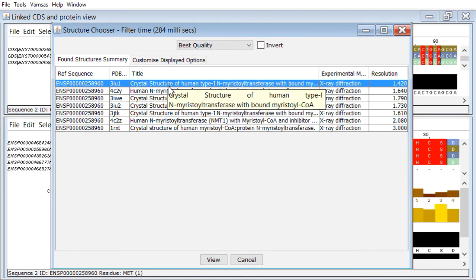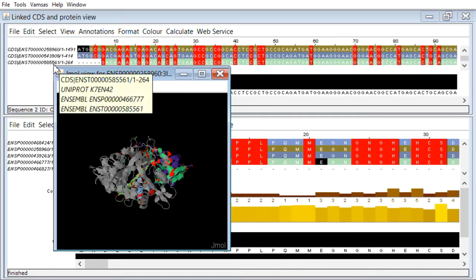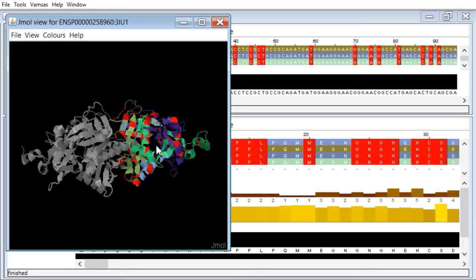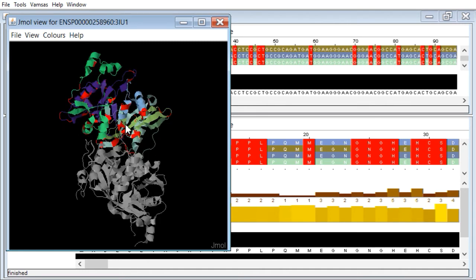And there we go. Crystal structure of human type 1 N-myristyl transferase. Let's go with that and view that. This comes back and it displays it using the Jmol applet. It is possible to get this into Chimera as well. I'm going to make this a little bigger. Grab on that left mouse button, drag that, and we can spin it around quite happily.